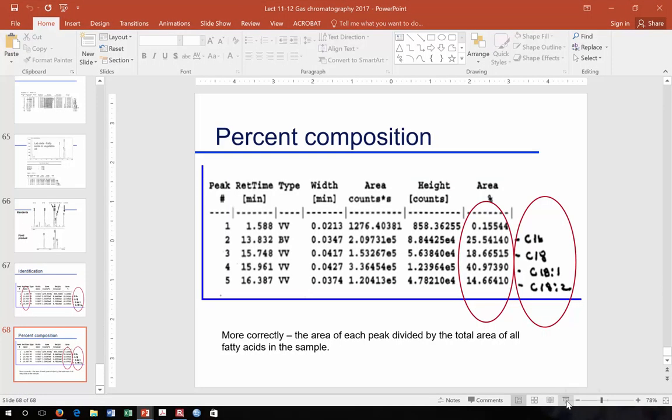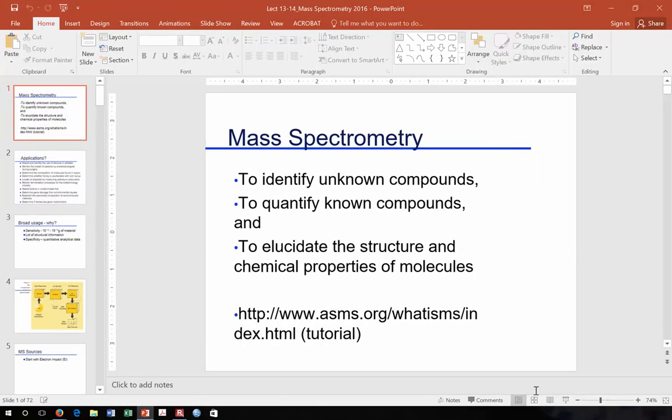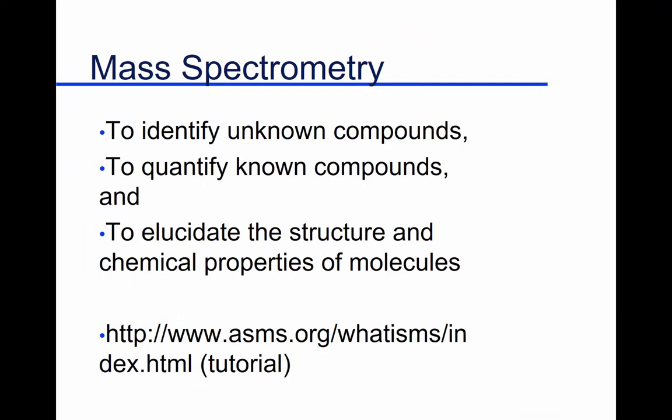Okay. These data are really pretty accurate. We're kind of assuming all of these fatty acids respond the same in the instrument. And they're close. They respond to carbon-hydrogen bonds. If you put some oxygen, you put some other things in there, it messes you up a little bit. So butyric acid won't give you quite as much response as stearic does. Stearic has all kinds of carbon, hydrogen, and so on. Butyric has only four carbons. Then it's got an oxidized group at the end. So we tend to just kind of slough it off and say they're all the same. They aren't, but they're close enough. That we don't tend to worry about it too much.